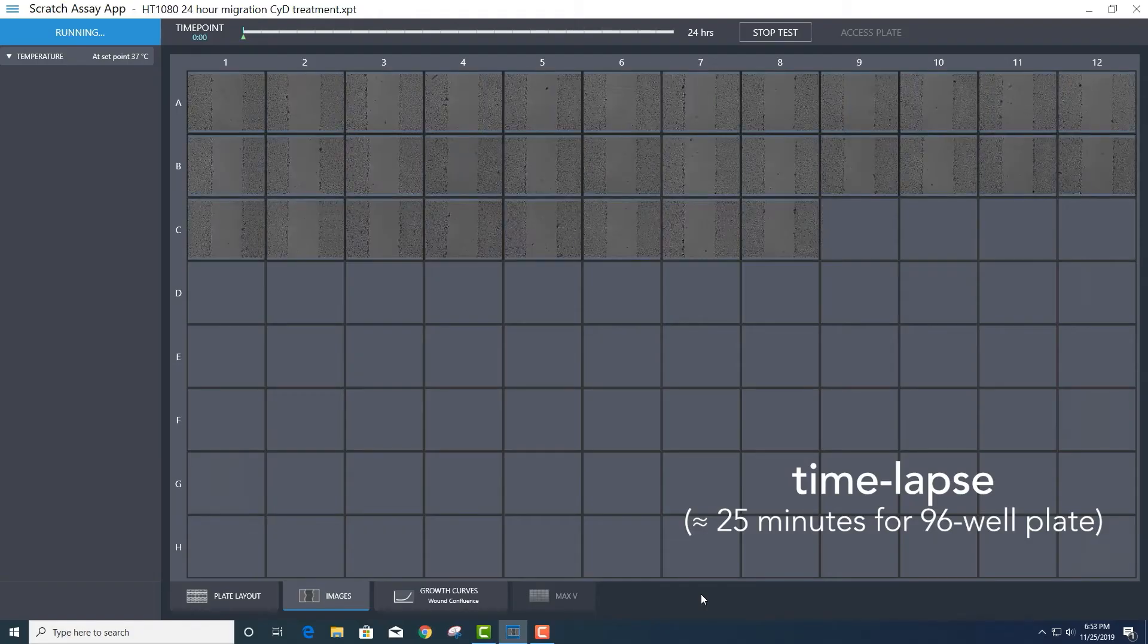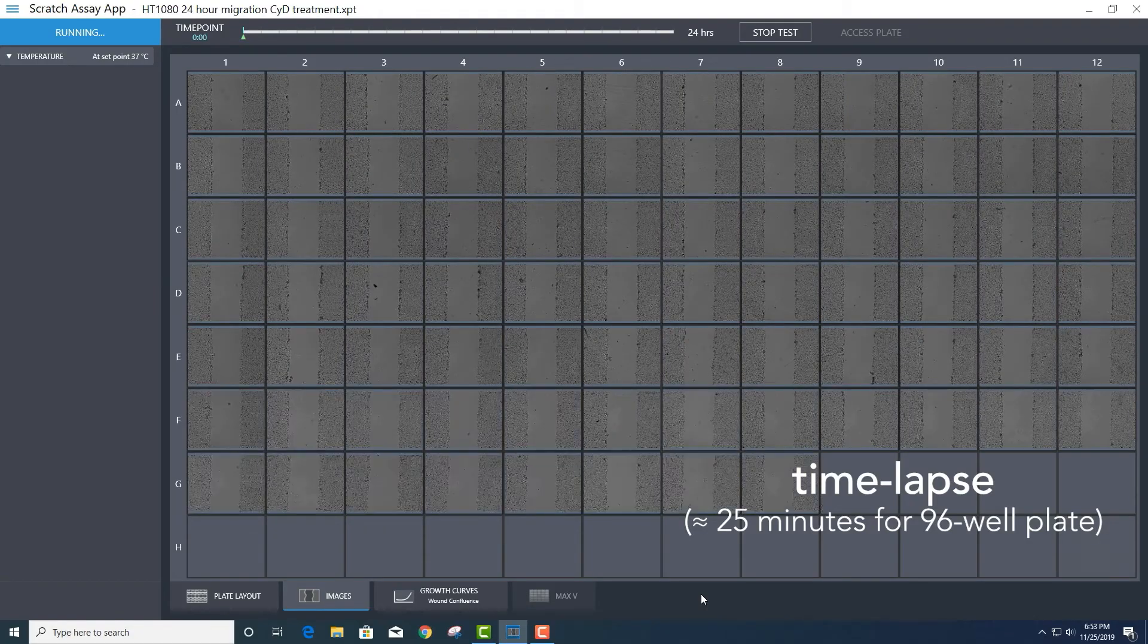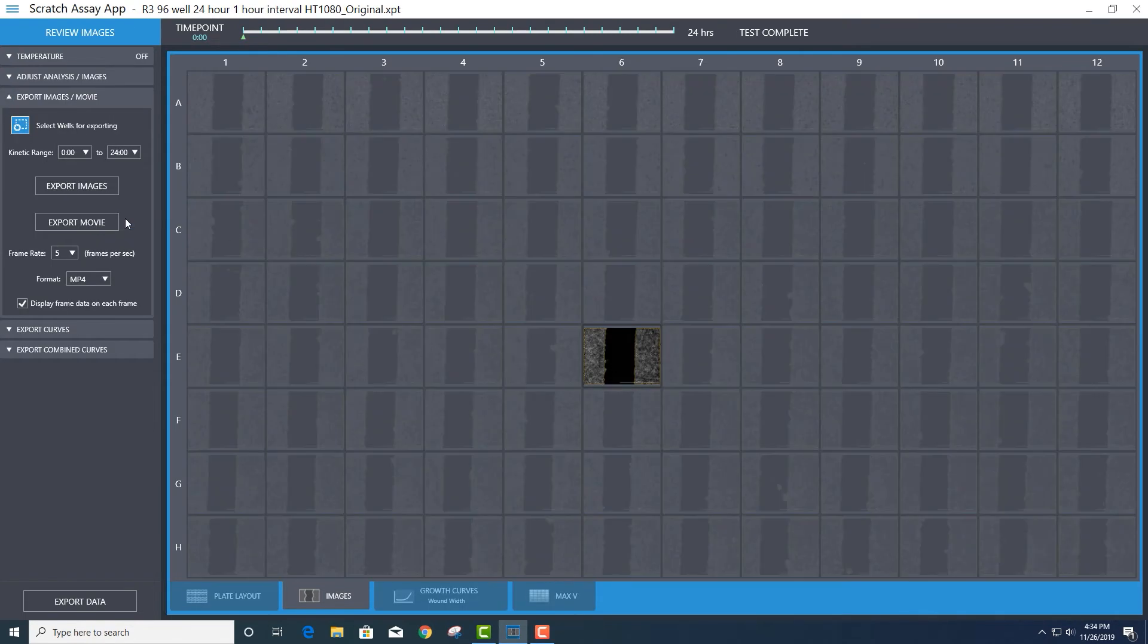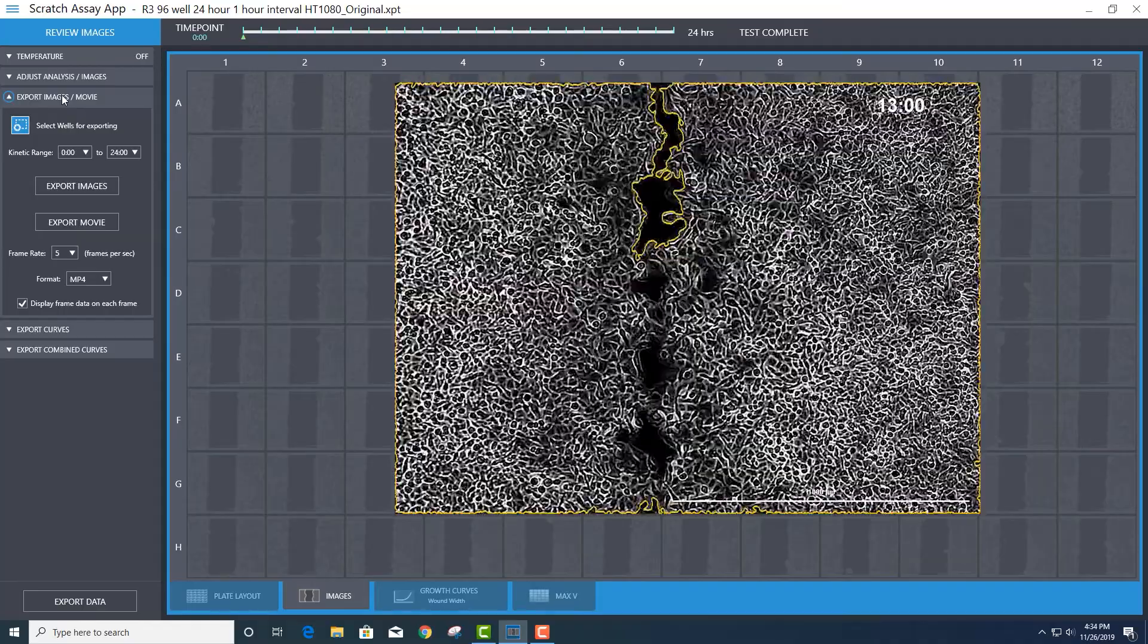Once the assay is started, images are automatically acquired using optimized exposure settings and focus. Powerful image analysis tools are used to generate reproducible quantitative results with kinetic cell migration profiles reported in real time.